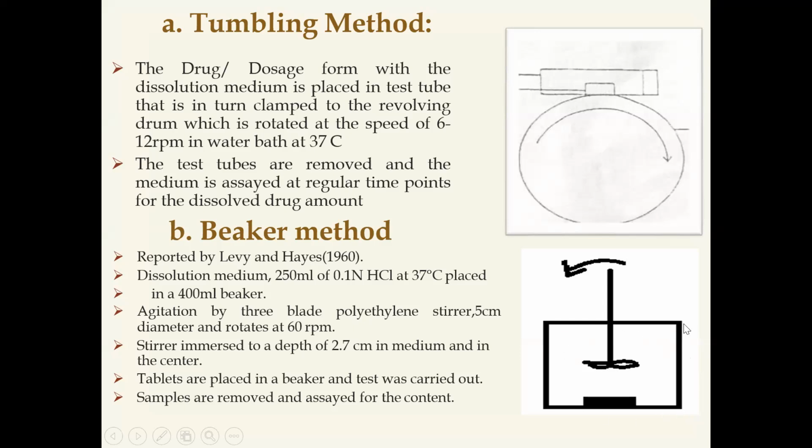This is the stirrer, which will rotate at the speed of 60 RPM. This is a wing blade stirrer. This is the dissolution medium. This is the dosage form.